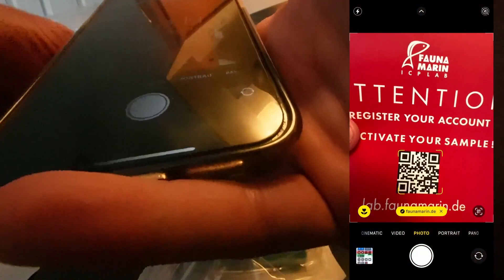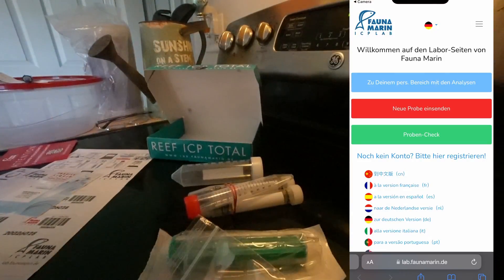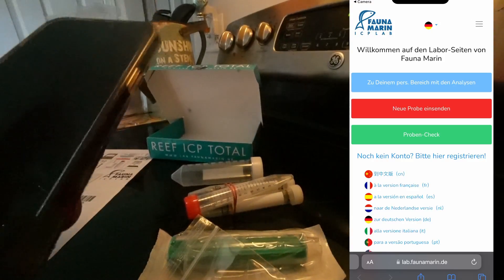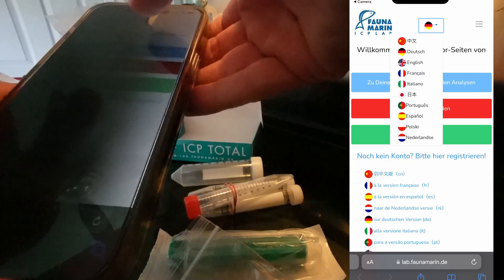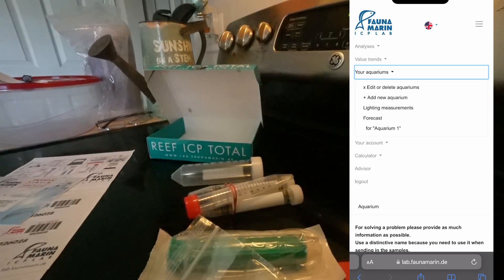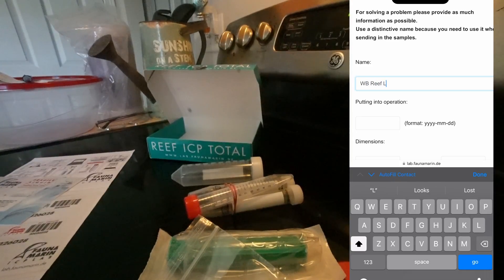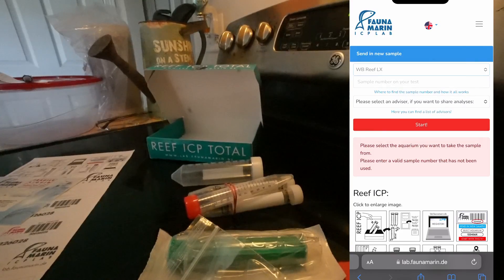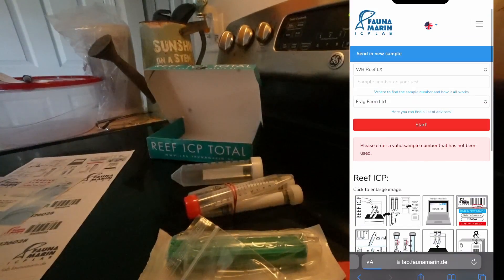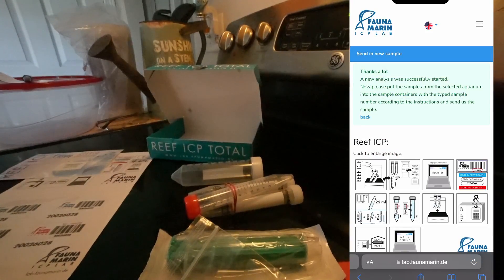I'm going to go ahead and work on getting the account registered. Let's scan the QR code and go to the website. Upon visiting the website it looks like everything's in a different language — probably German — so we'll change that to English. Going to aquariums, I'm just going to call this 'Water Box Reef LX,' send a new analysis — Water Box Reef LX, Frag Farm Ltd. — and the start sample number on the test is 200260-28. Everything should be set up now.